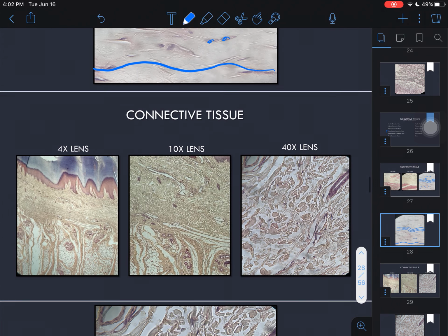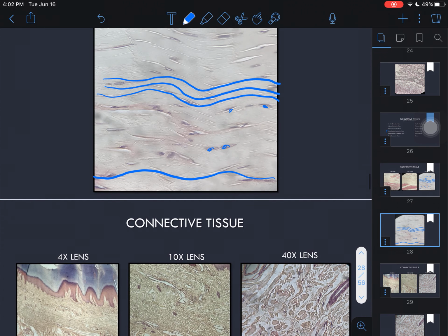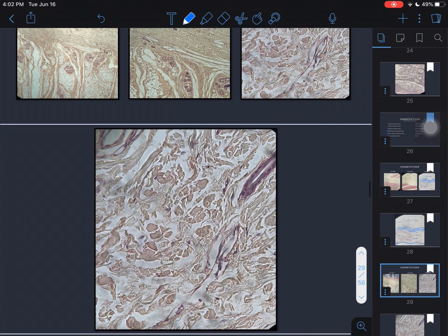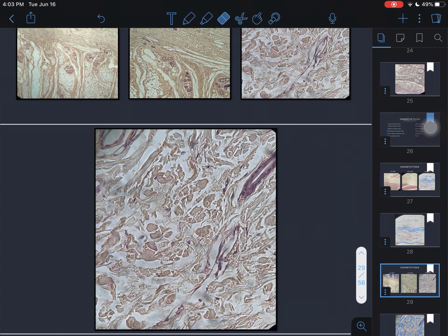Versus irregular. Our irregular one looks like somebody took this, added some nuts, and then swished it all together, right? There is no regular pattern here. It's still kind of dense. We don't see a whole lot of nuclei. They are there. This dye just doesn't really do well with them.